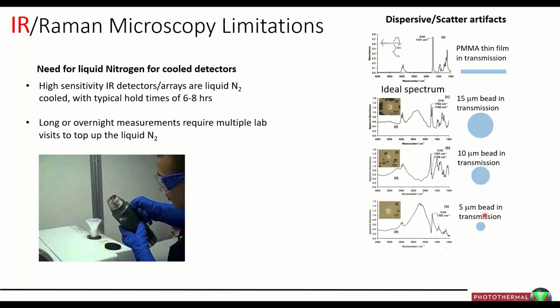So as we change the shape of these particles, the spectra change as well. And it really goes to show that spectra are very much particle shape and size and even surface topology dependent, which kind of goes against our goals here. If we're using infrared spectroscopy to identify materials, we don't want the morphology of the materials confounding the spectra, and this is often the case.